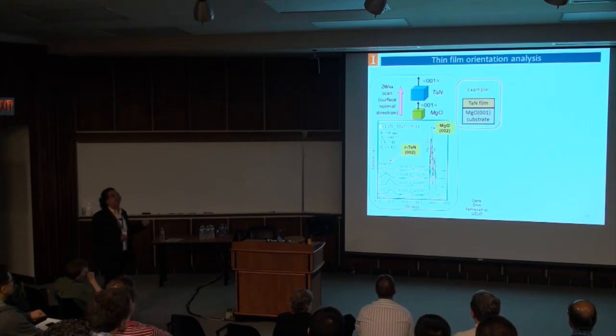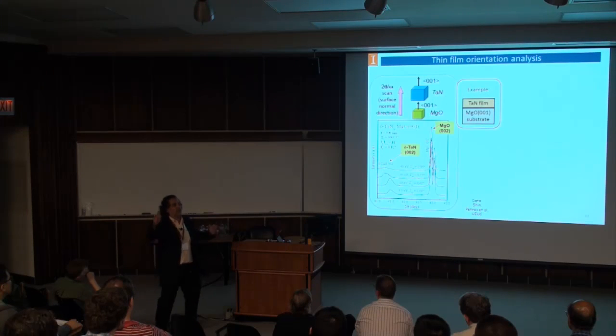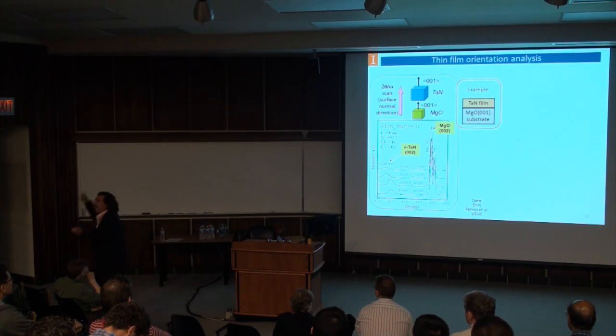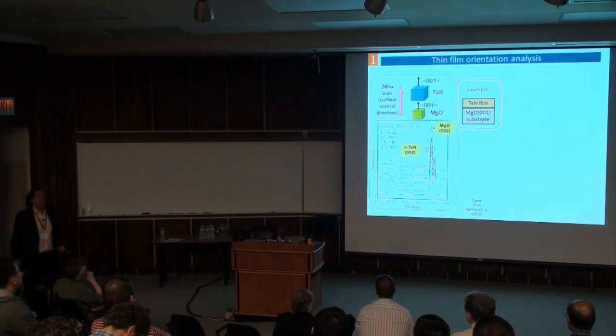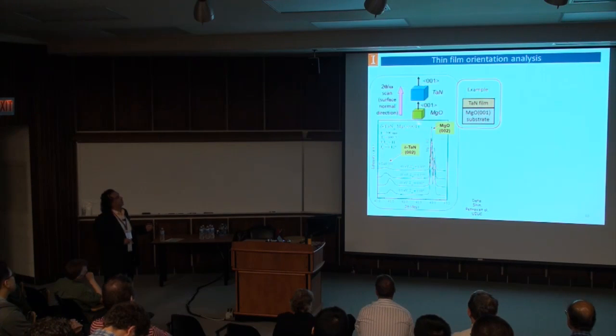And then many people here make one mistake. They go out in the hallway celebrating, saying, "Oh, we did that, this means the film is perfect. It's epitaxial, because the orientation is matching exactly there." Well, remember the 2 theta omega scan I told you? You are just probing this direction. You are just seeing that in one direction it is well aligned.